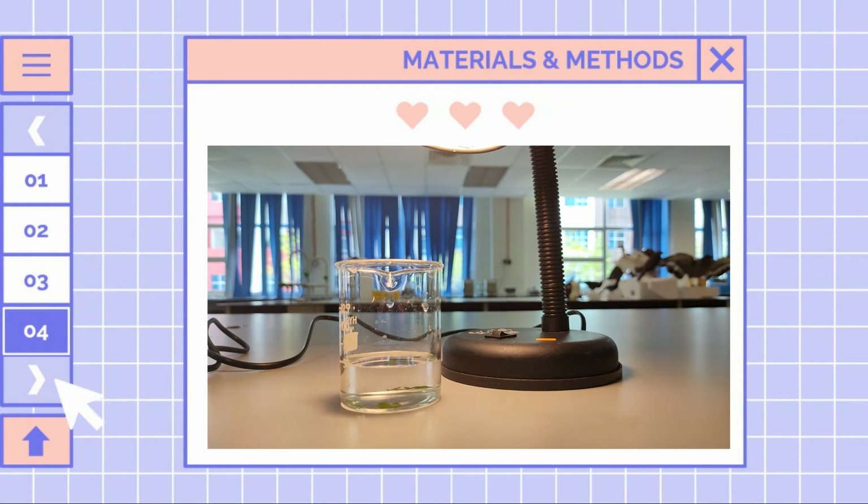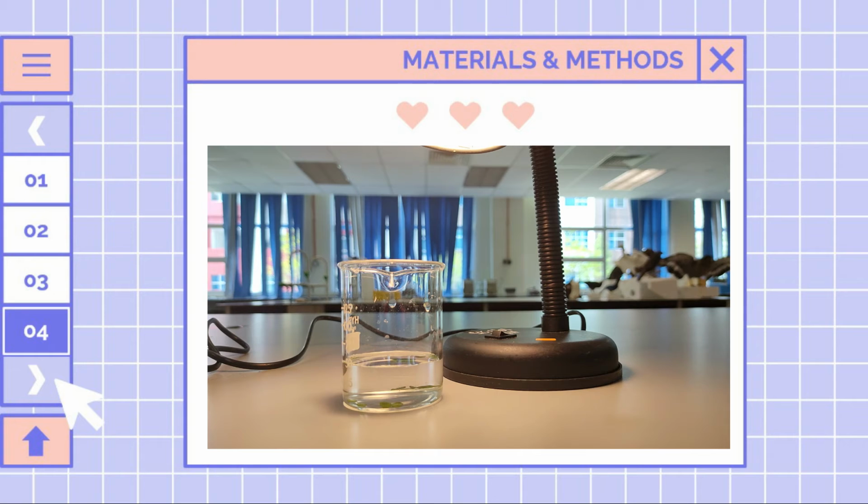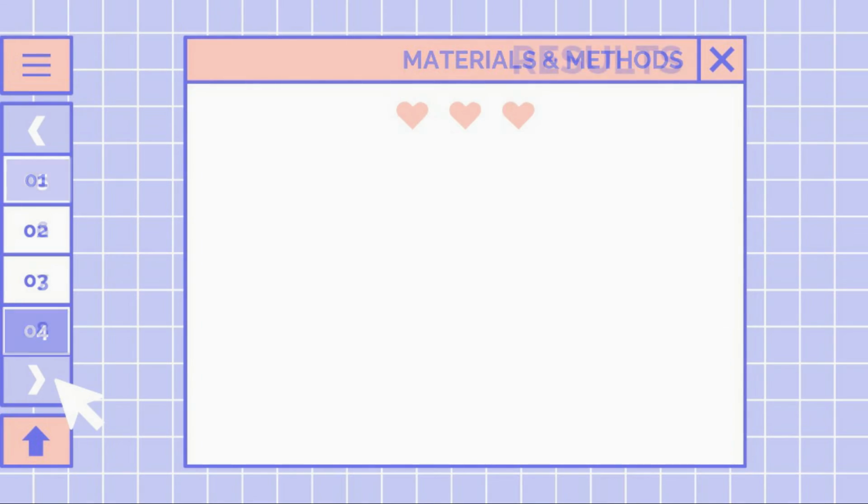Watch the leaf disc at the bottom of the cup. After several minutes, the disc should begin floating to the top of the solution. Record the number of floating discs every minute until all the discs start to float. Once finished, remove the light and put the cup in the dark for 15 minutes or cover with an aluminum foil. Repeat steps 3 to 15 using the same leaf, but set up the torchlight so that it is suspended about 10 cm above the beaker.